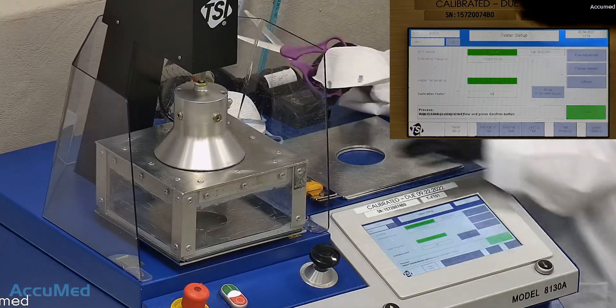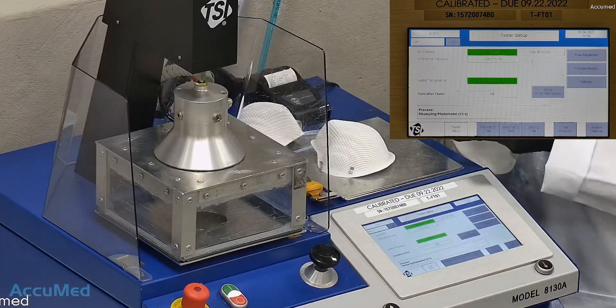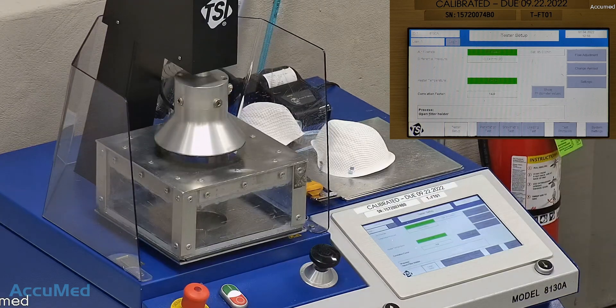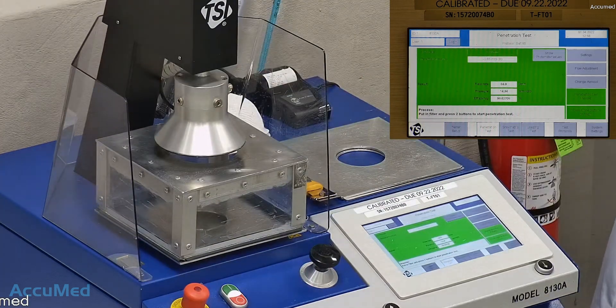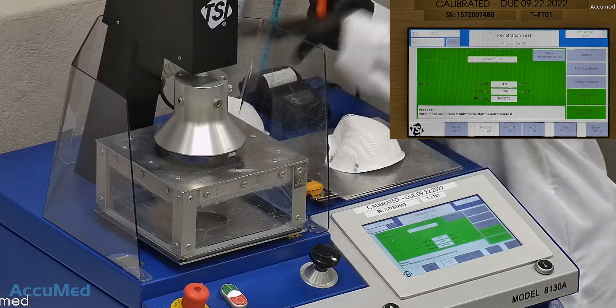As mentioned, this is our TSI machine model 8130A. This is the same filtration testing machine that NIOSH uses to approve N95 respirators.